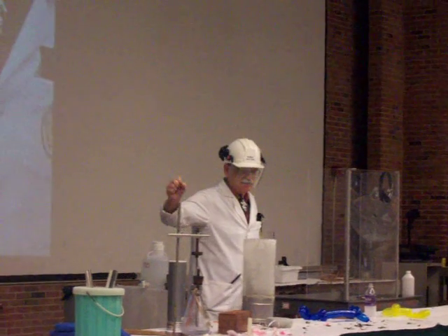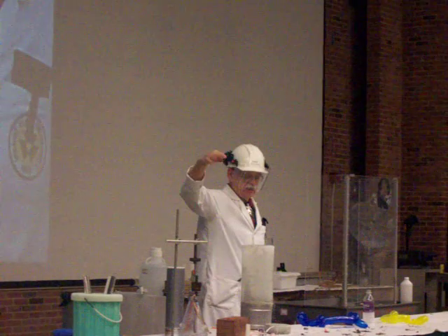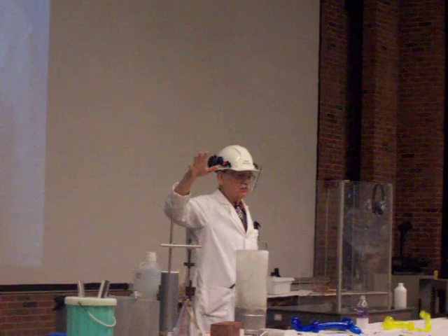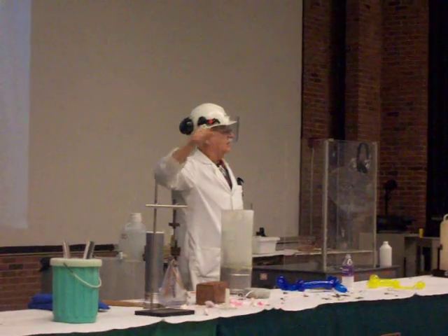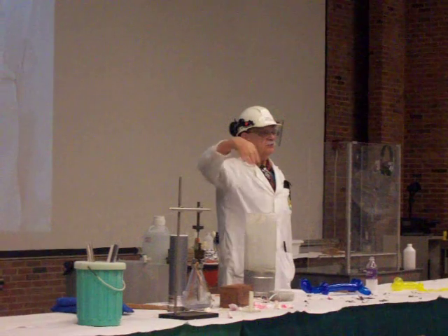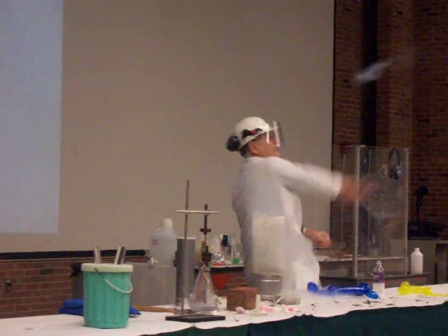I'll just put my hand down in liquid nitrogen and take it out. If you missed that, I'll do it again. I'll put my hand down in liquid nitrogen and take it out. I can tell that some of you are skeptical that I actually put my hand down in the liquid nitrogen. In fact, I can take some and throw it at me.